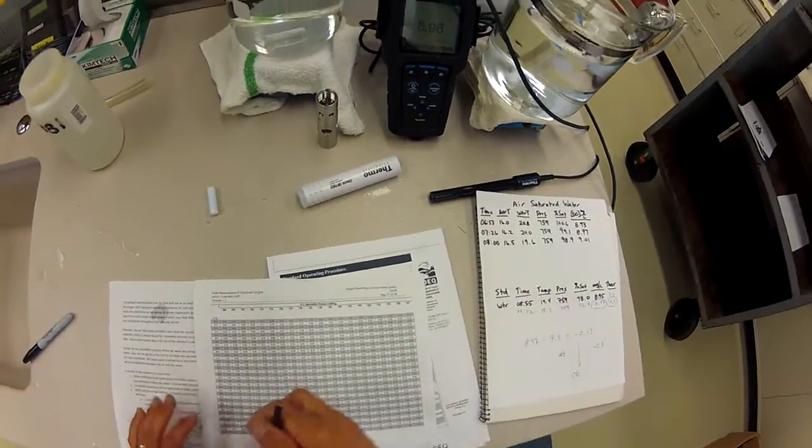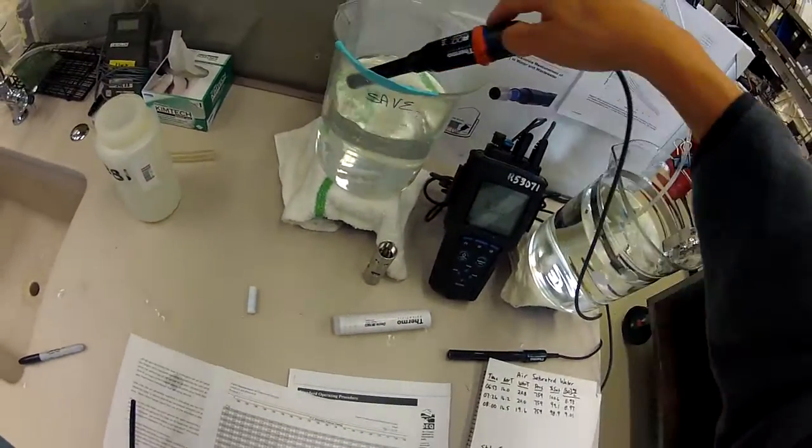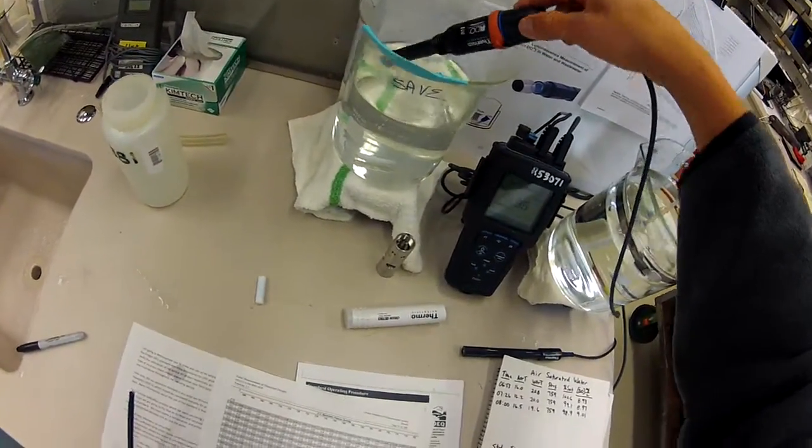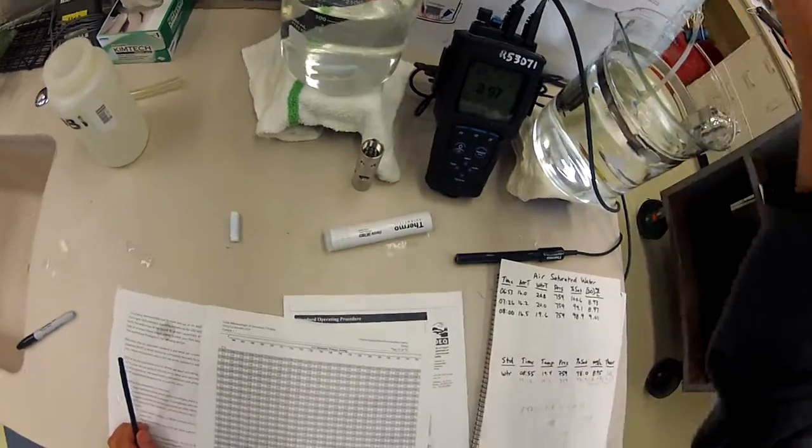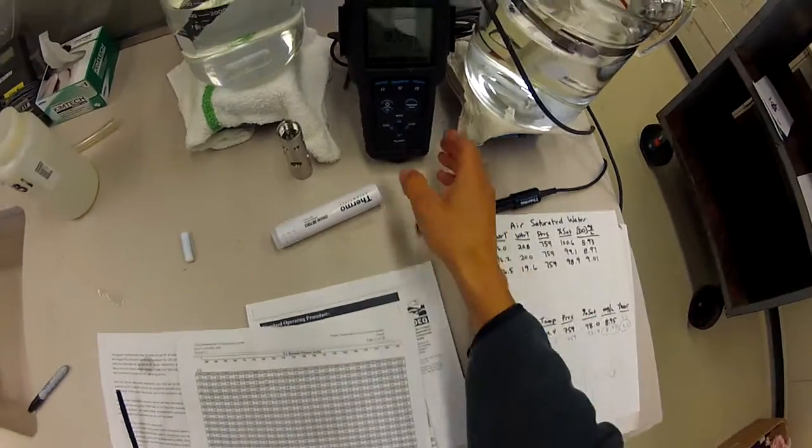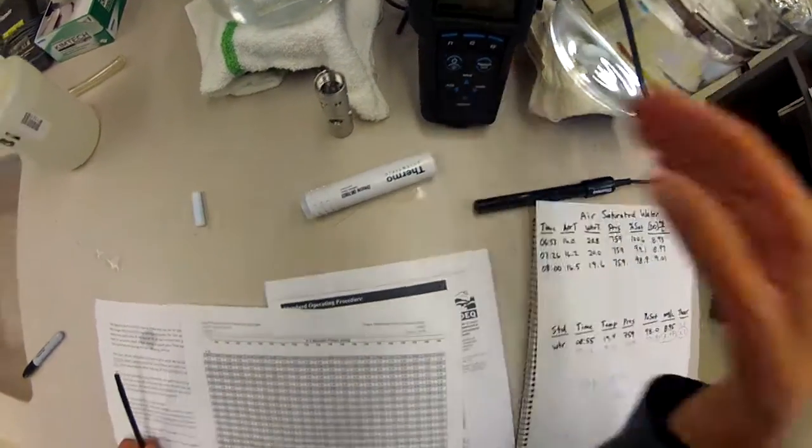If we were doing a DOC, we would want to take the probe out and take four measurements and follow the DOC procedures. That's it for air saturated water. Thanks for your time.